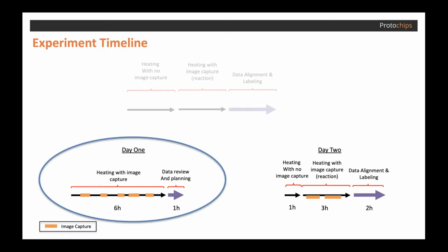To begin the day 1 work, we would perform a slow preliminary heat ramp over the full select temperature range, and we'd identify the key moments of any reactions. We would need to be carefully documenting everything along the way that we noticed in order to capture even subtle changes in behavior, and we'd capture pieces of images along the way as possible. This will take time. Once any reactions are witnessed, it becomes possible to plan the next experiment and target specific moments that may have been missed or could not have been recorded at the proper magnification.